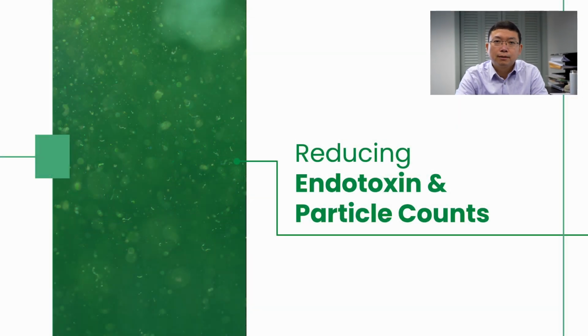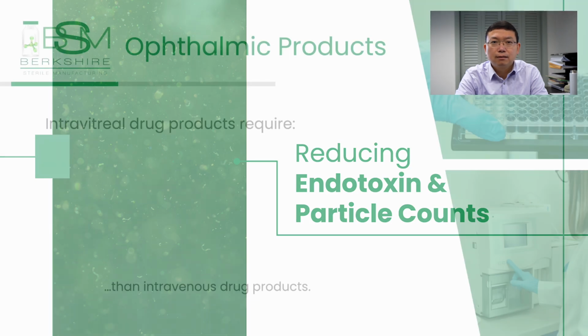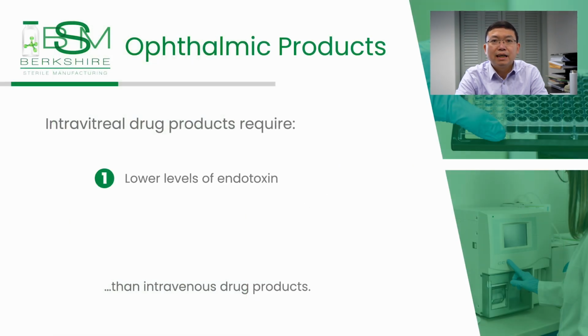Yes, Sarah. Intravitreal drug products come with specific requirements due to the unique administration site, which demand lower levels of endotoxin and particle counts compared to intravenous drug products. This will affect how we process the drug product, what materials we select, and of course, what limits we test for quality testing.